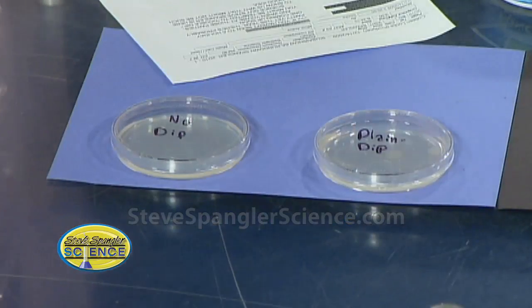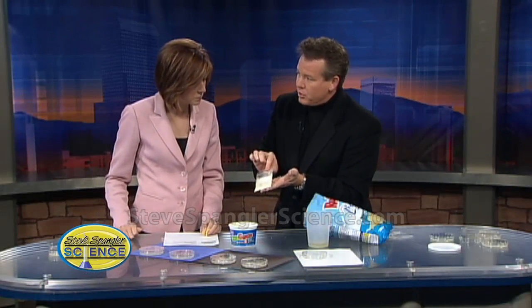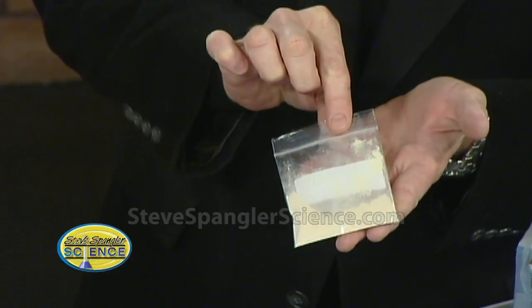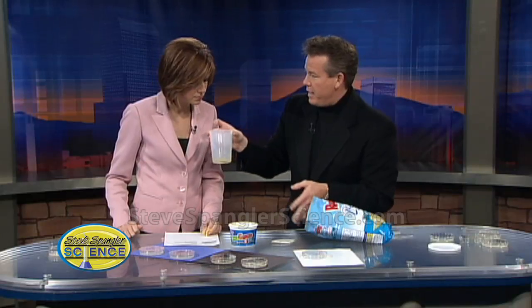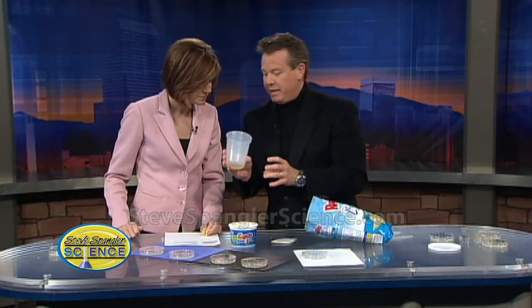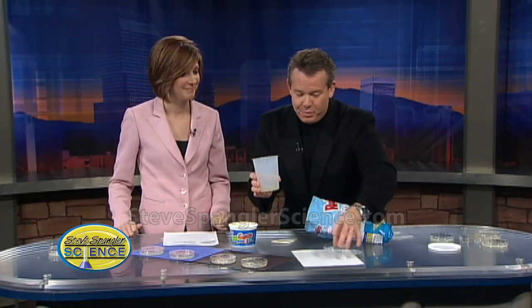Sometimes we jump right in, but I wanted to show you how to make the petri dish. This is agar — nutrient agar — it starts as a powder and you mix it with water, which is what we've done here. Now smell that — interesting, that's vile, isn't it? That's horrible. You take this and pour it into the petri dish and let it thicken — it's kind of like jello.